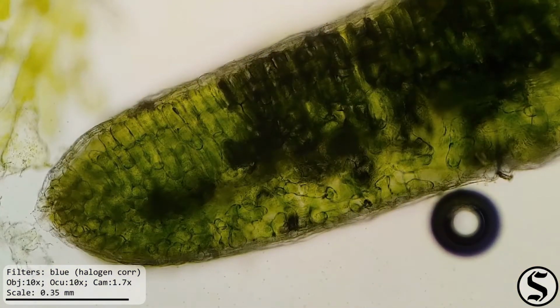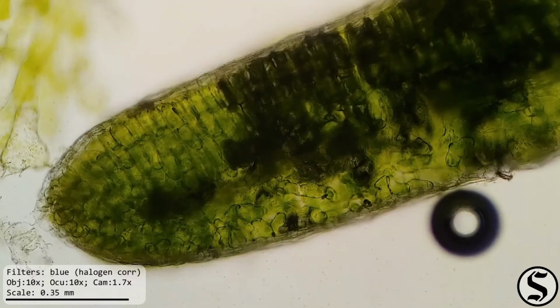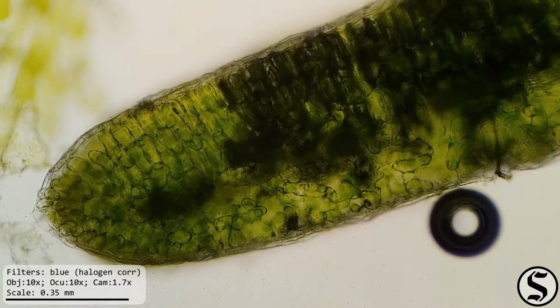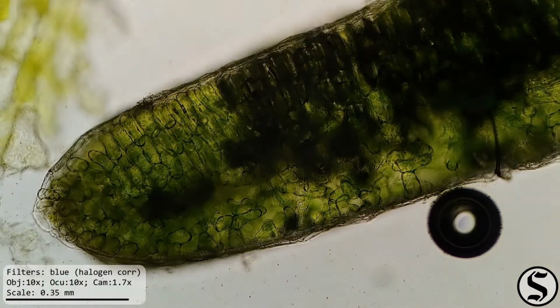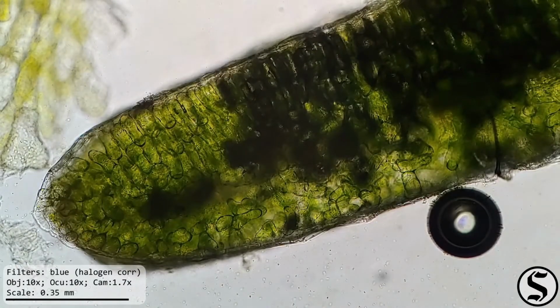Well, I thought it was really cool to be able to look at a cross-section of the spinach leaf. I wasn't entirely sure how well that would work out, but I think it's always worth experimenting because sometimes you get exactly what you're looking for, which we did.